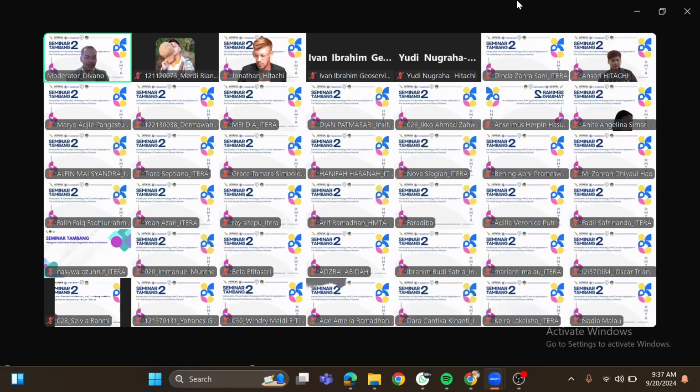Oke Pak, ternyata ada yang langsung direct message ke saya. Jadi ada yang bertanya, AMICS itu bisa mendeteksi liquid material nggak sih Pak? Kalau misalkan material itu ketutup sama liquid, apakah masih bisa dibaca oleh AMICS? Terima kasih. Oke, terima kasih pertanyaannya. Sorry, liquid ya? Iya betul. Jadi karena ini dilakukan di SEM yang mesti dalam kondisi vakum, jadi liquid itu tidak bisa.